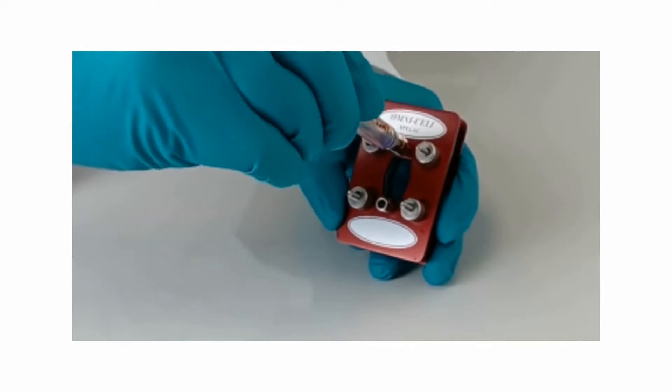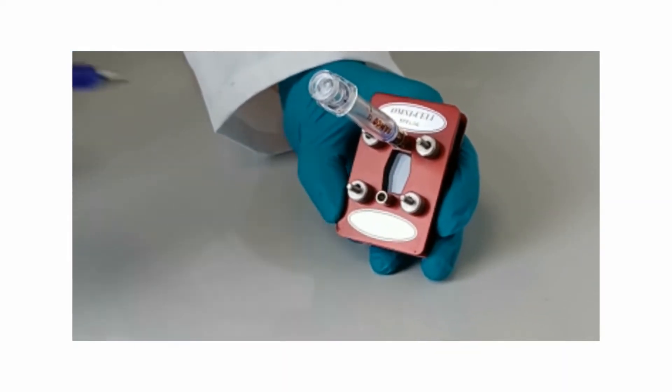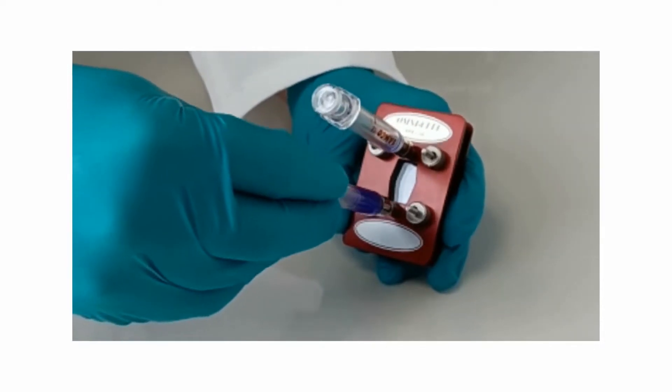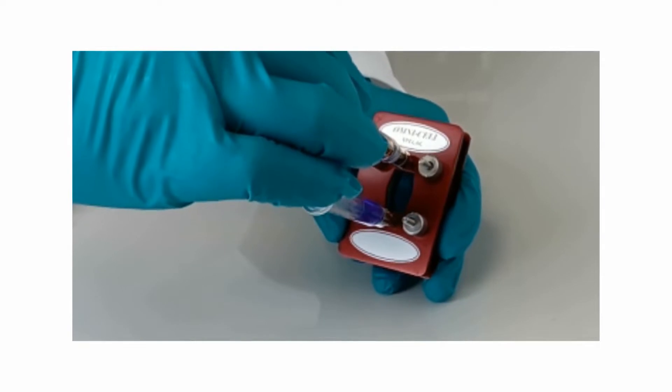Tilt the assembled cell slightly, then attach an empty syringe to the top port. Attach a filled syringe to the bottom port, then pull the sample through the cell with suction by drawing on the empty syringe.